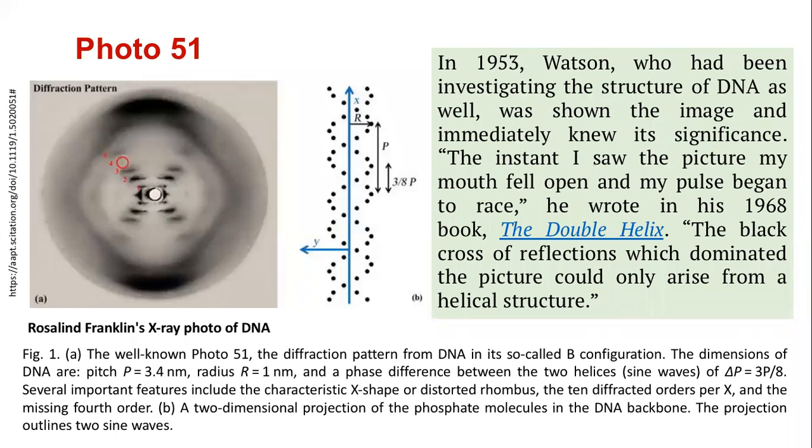And interestingly, there is a small read from The Double Helix, the book written by Watson, in which he mentioned how excited he was in seeing this X-ray diffraction pattern of the DNA molecule by Rosalind Franklin, which clearly depicted the double helical nature, and not just that, but also how the molecules are arranged within the double helix: the distance between each turn, the nucleotides, etc.